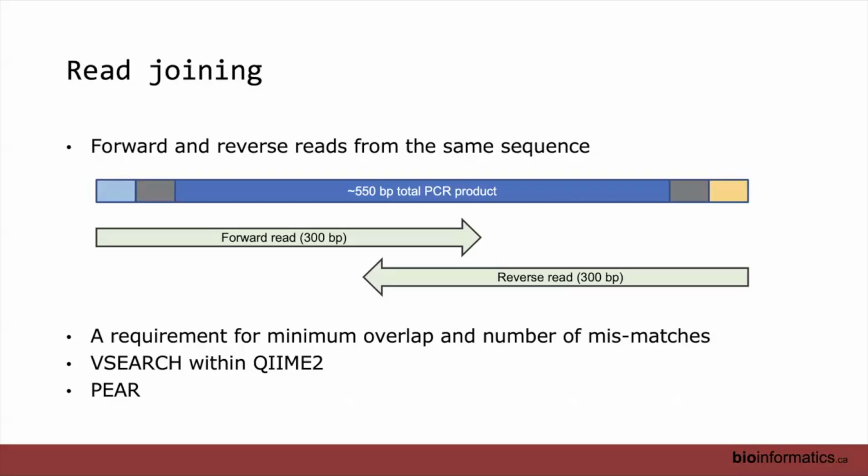And you will also have a certain length for the primer sequences that you have in there as well. And what you want to do when you're designing these primers is make sure that you have enough overlap in the middle that you will be able to join those reads together, if that's what you want to do. This is not really based on science. This is based on my feeling, maybe like 25 base pairs at least. That seems reasonable to me.